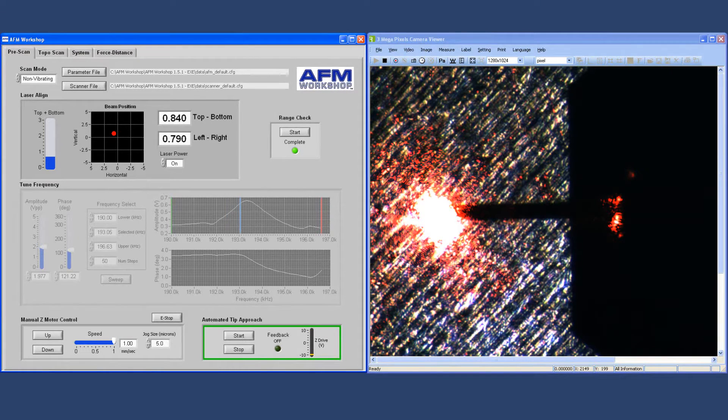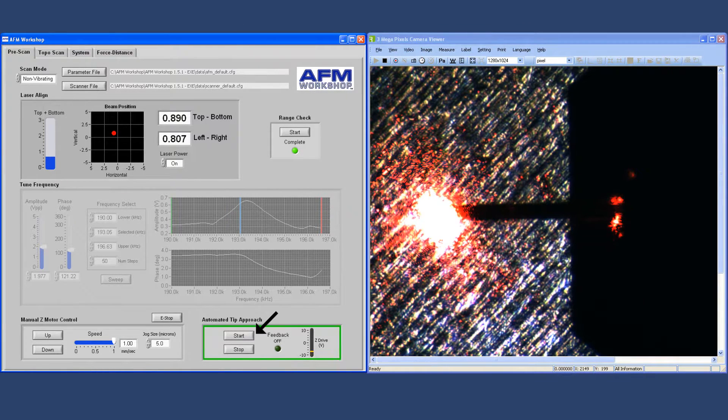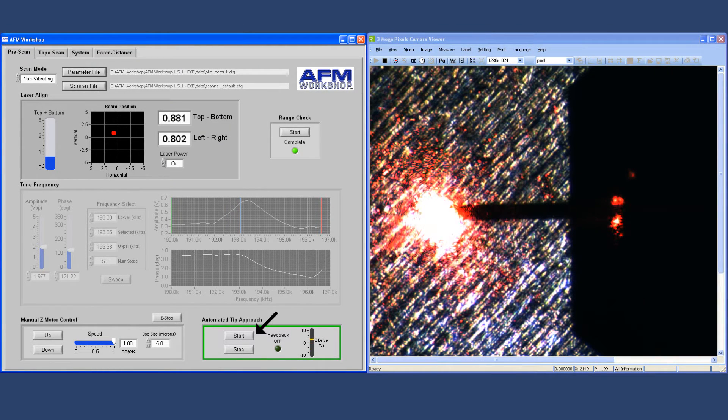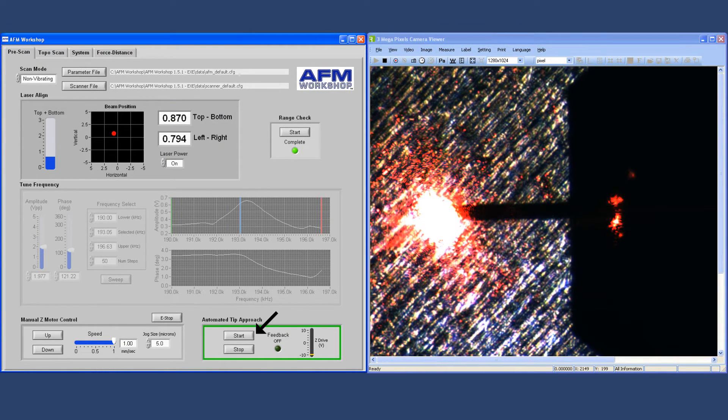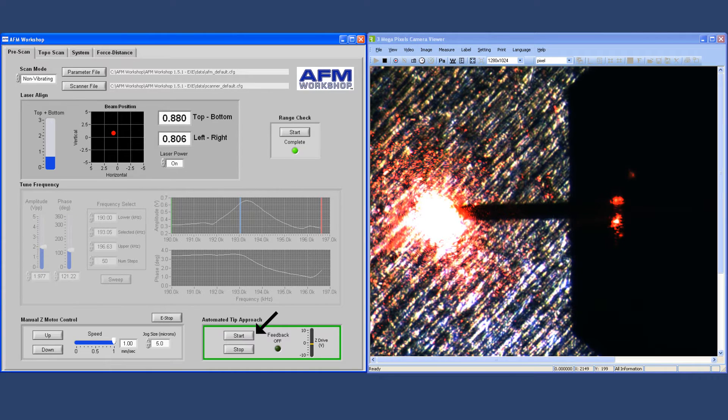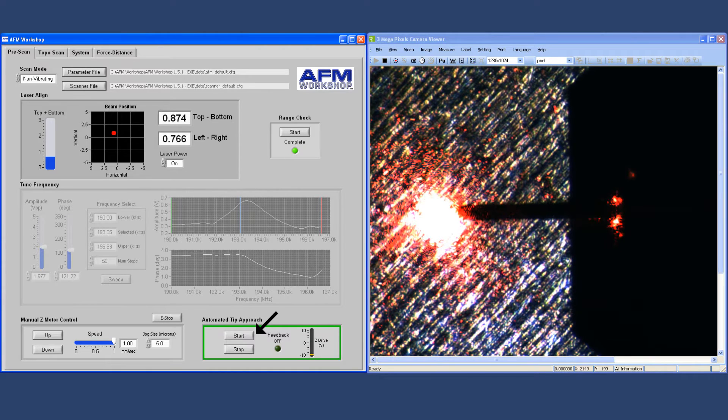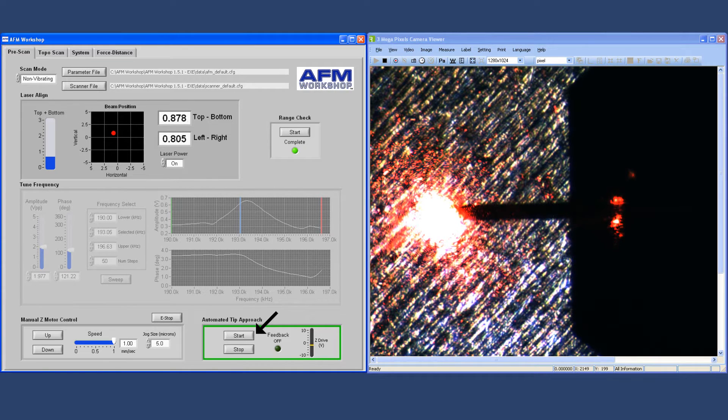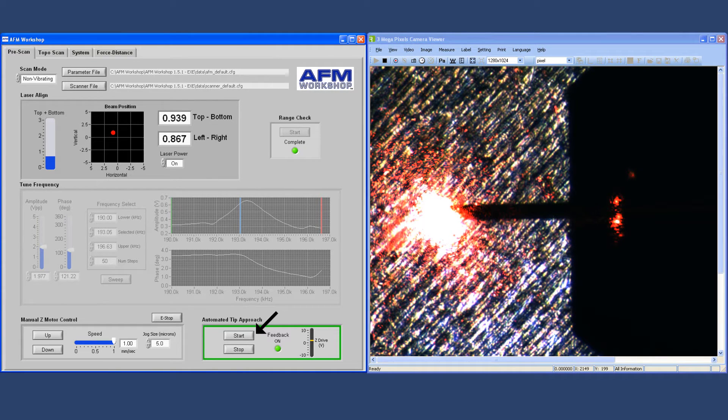Once this is done, you can go into tip approach and start moving the probe towards the surface. This takes a few minutes depending on the distance of the tip from the surface.